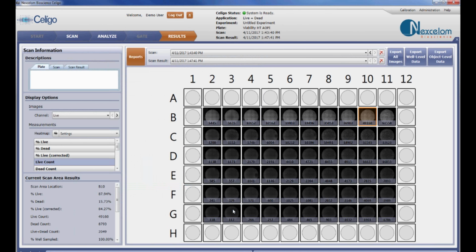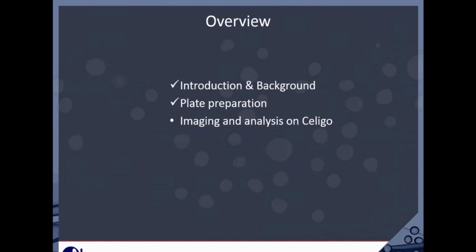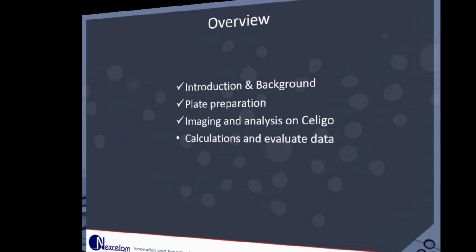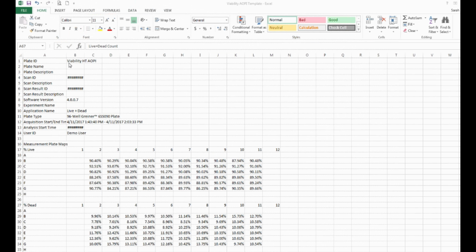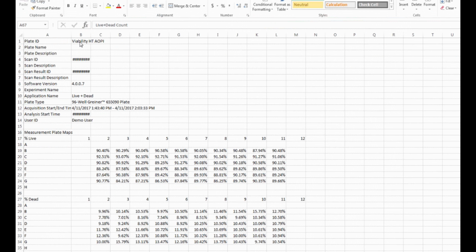Okay, so we've exported it and saved it on the desktop. Now we've covered imaging and analyzing. The imaging and analysis is pretty easy. It's only 2 channels. If you do the illumination right, the default settings work on the Analyze tab. Now I want to show you how to calculate the cell concentration, cells per mil, and figure out what the dilution factor is for a large range of unknown samples.